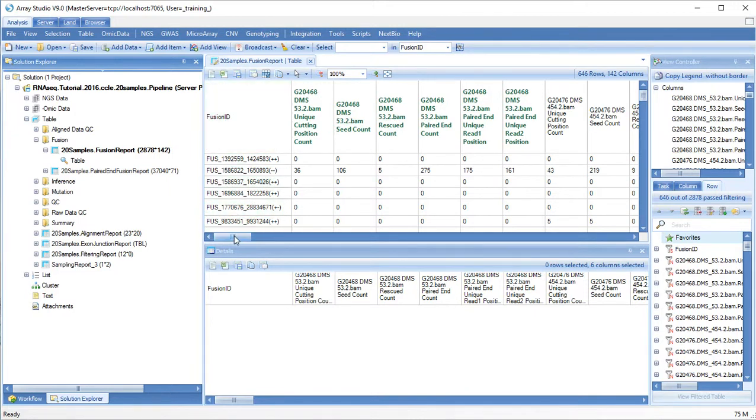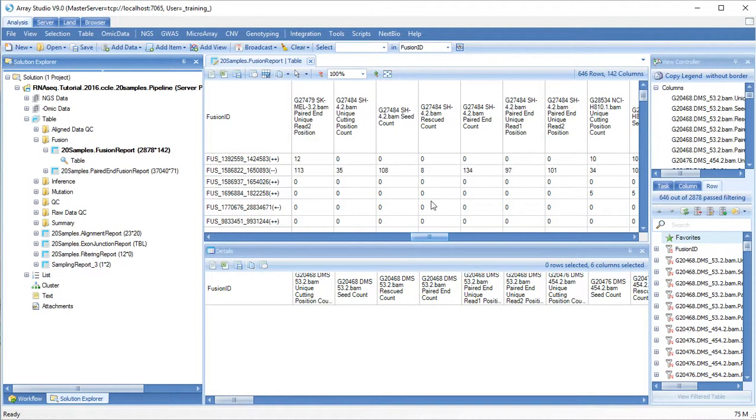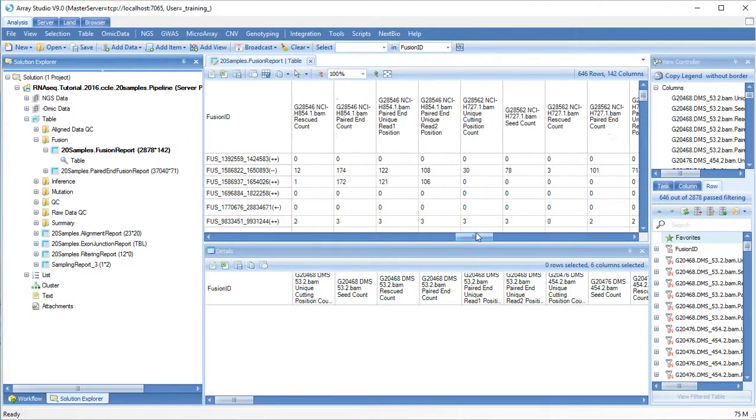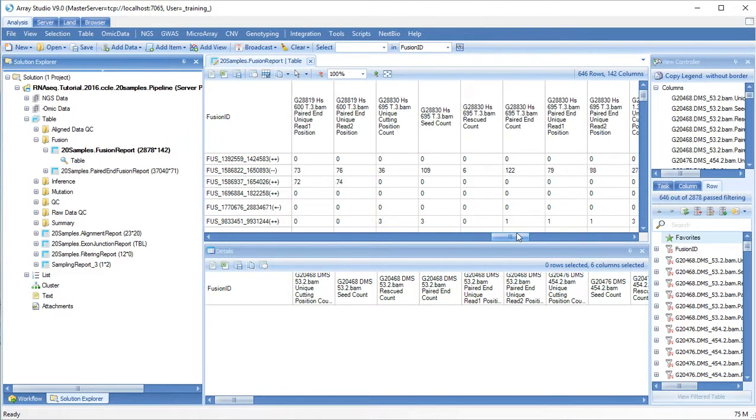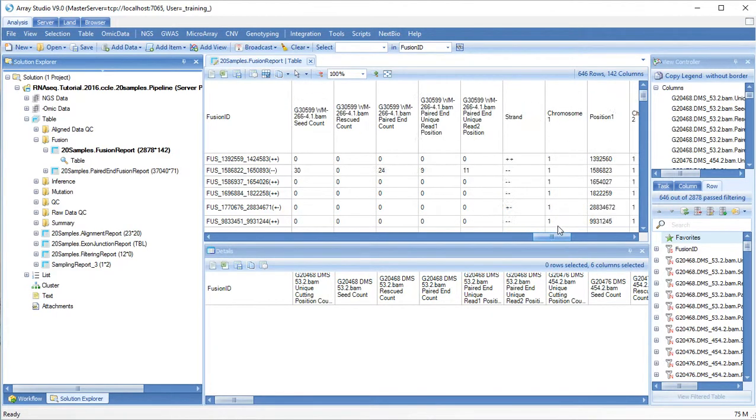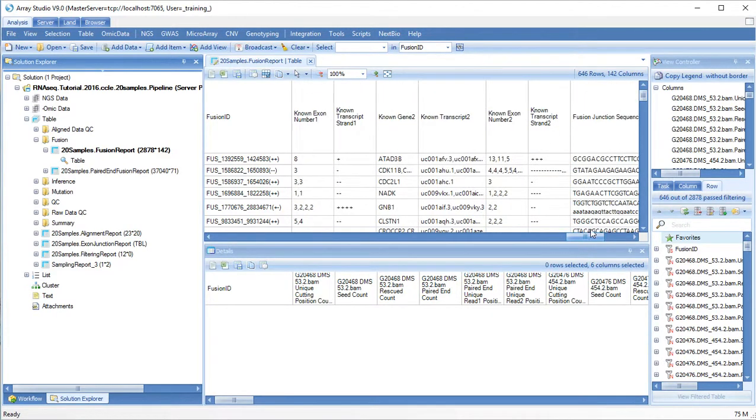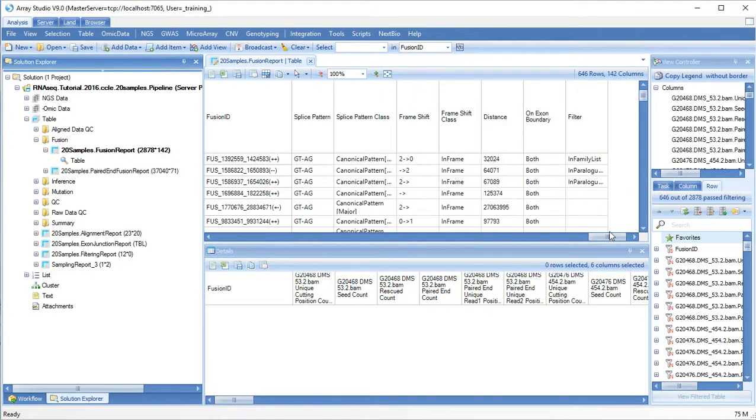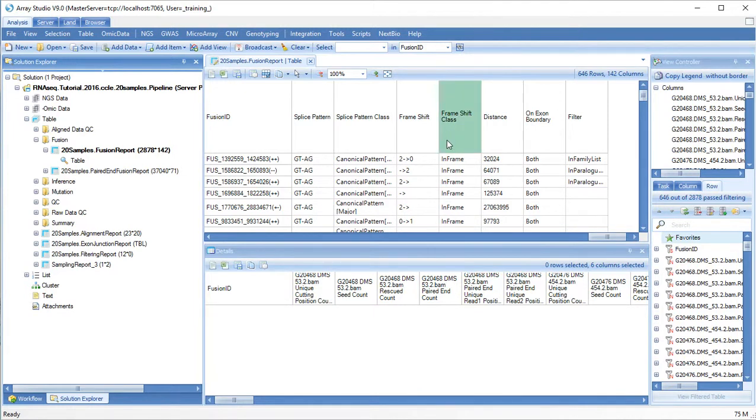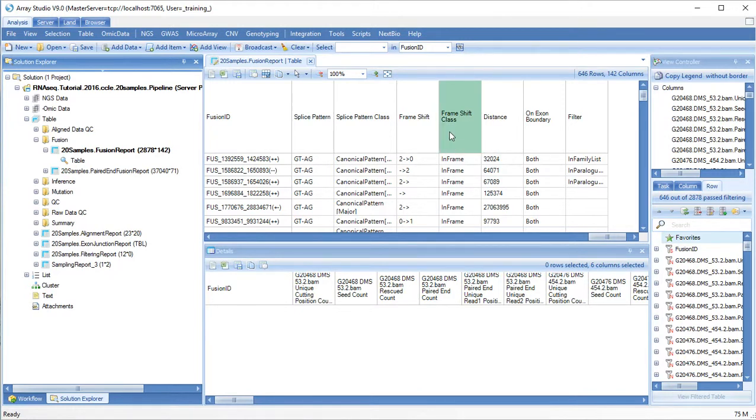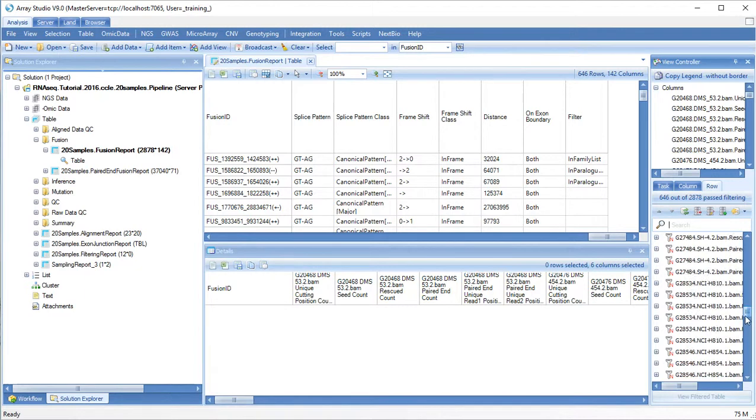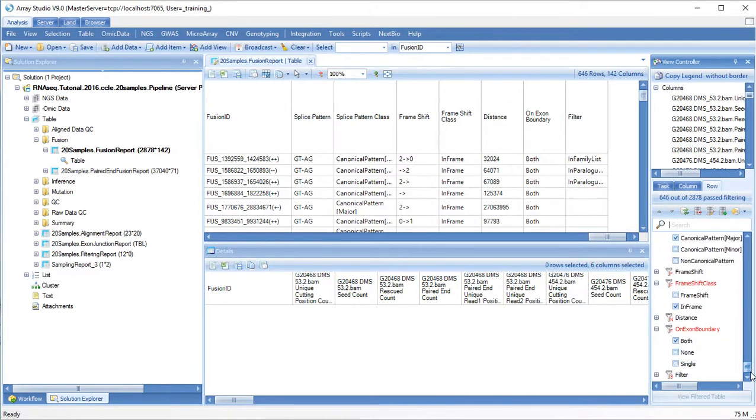At the far right of the table you will find additional information about your fusion event. These data can be filtered, for example, to only find in-frame fusion events. We can also show frameshift fusion events.